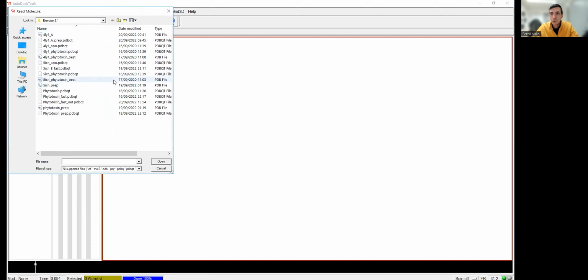Most likely you will have a default folder here, which is not really convenient. So I will teach you how to change the default directory, because at some point it will make you crazy. You have to change the directory once and once again. So go to File, Preferences, Set. Here you can define multiple options. And check this startup directory.